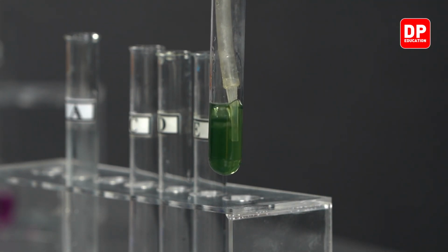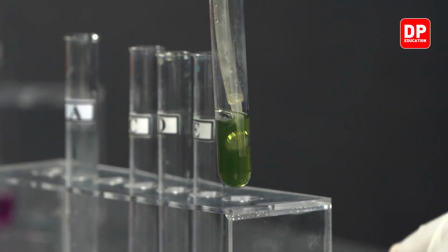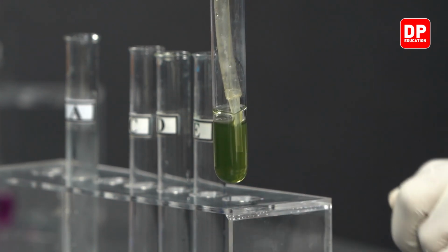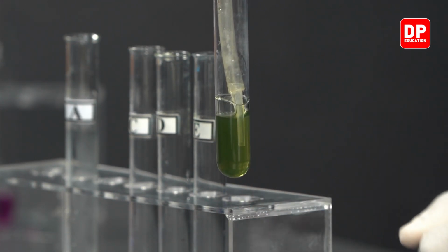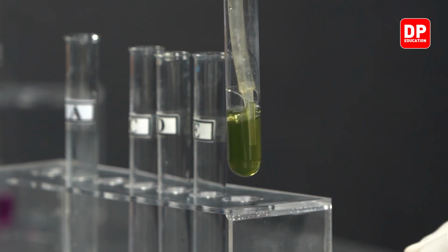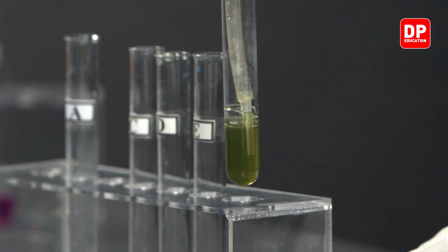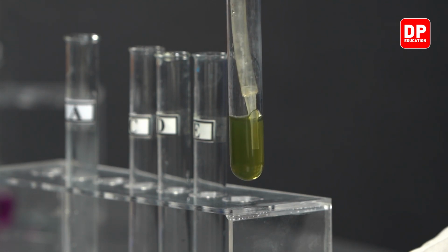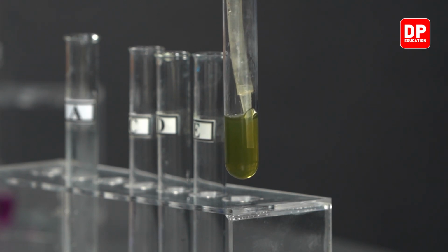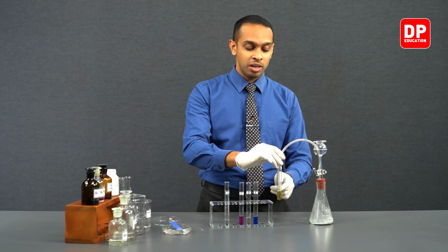However, due to dispersion of these fine solid particles, you are going to observe the green color decreases gradually, and the color of this suspension is now gradually changing to a brown color. So the green color solution gradually turns to a brown color. We can see that there's only little gas coming out.